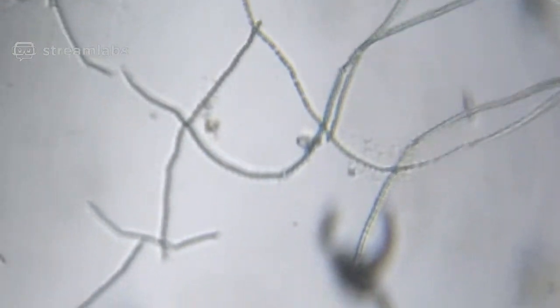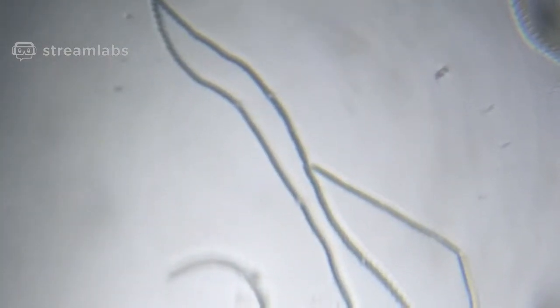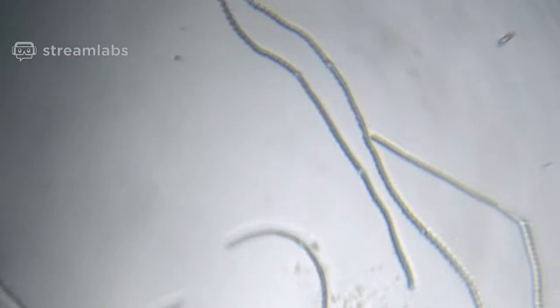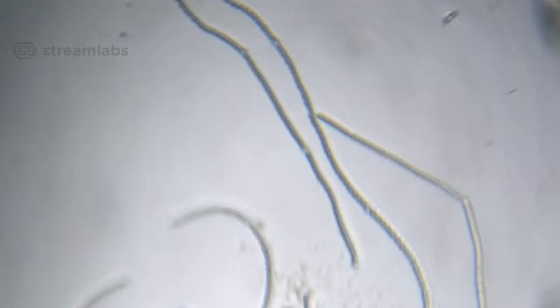Now let's get a good view. All right, so here you see a chain of cells, and you see that one cell that is not necessarily green but slightly round in the middle there. Yes. Right there, right? Now that cell does not photosynthesize. It is a specialized cell, and what it does is, you know how much nitrogen is there in our atmosphere? About 70%. And we need these bacteria to get that nitrogen down onto Earth into an organic form that you and I can consume and eat.